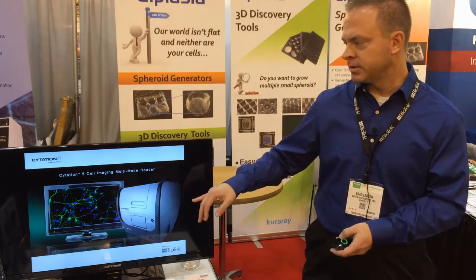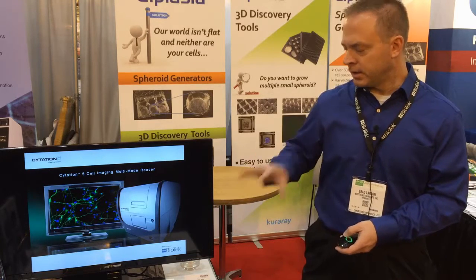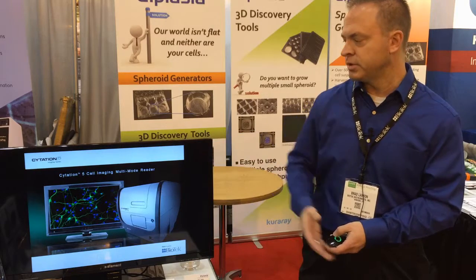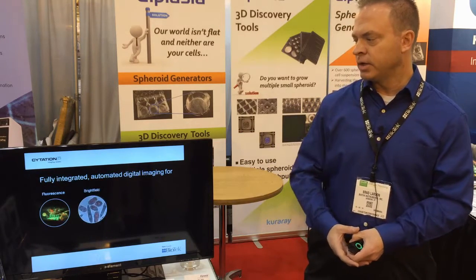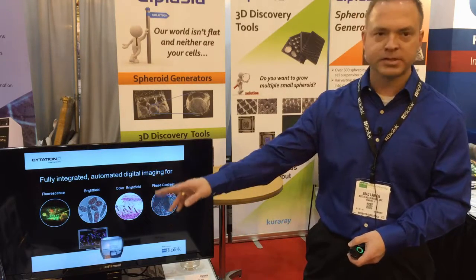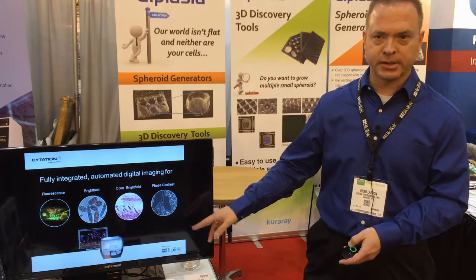This is our Citation 5 from Biotech. It's a combination of an imager and a microplate reader — a cell imaging multimode reader — that gives you a lot of capabilities. You can image in a number of different channels: fluorescence, brightfield, colored brightfield, or phase contrast imaging.